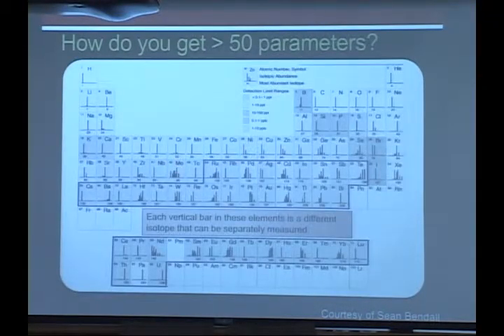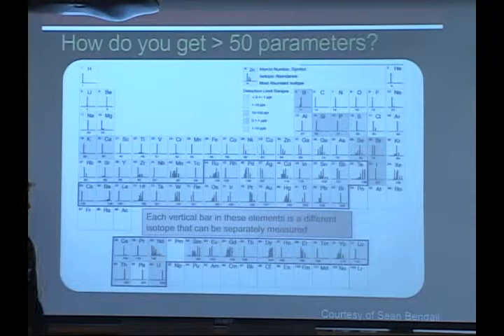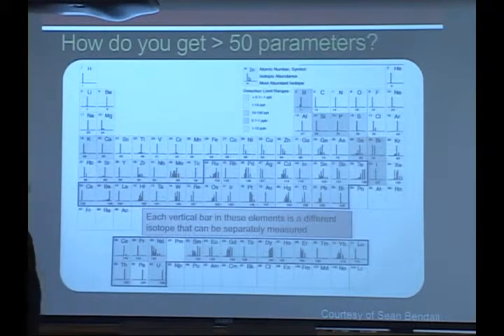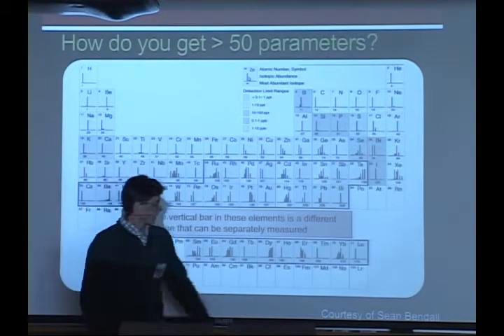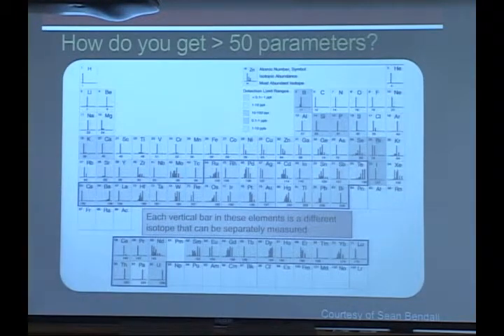And so when you look at the periodic table, what's surrounded here in blue are the atoms that we actually use in CyTOF application. So basically everything from a molecular weight starting at 102 atomic mass units all the way up to the end of the periodic table. We routinely use the lanthanides, which range in atomic weight from 139, which would be lanthanum, to 176, which is the highest atomic weight of ytterbium. So that's kind of the range that you're looking at on the periodic table.